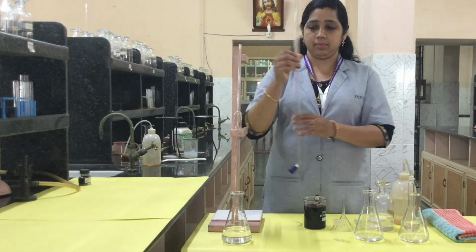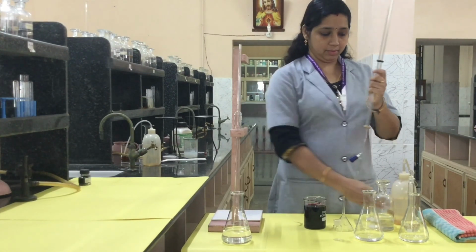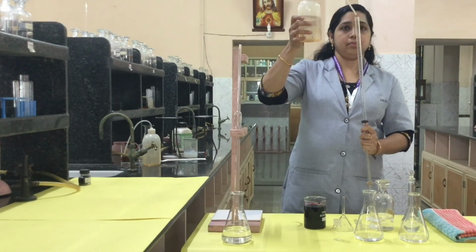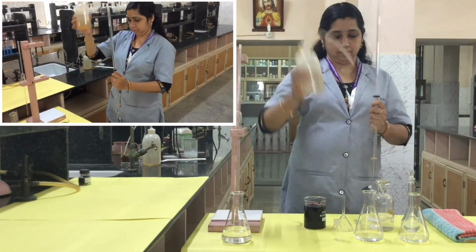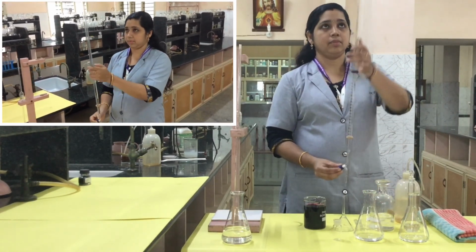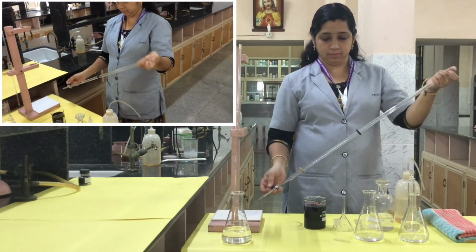Before taking the KMnO4 in the burette, first we will have to rinse this burette with water. The same procedure we have already done in the case of pipette. Like that you just follow. First, fill the burette with some water and rinse this burette. Just rinse the burette the same way.